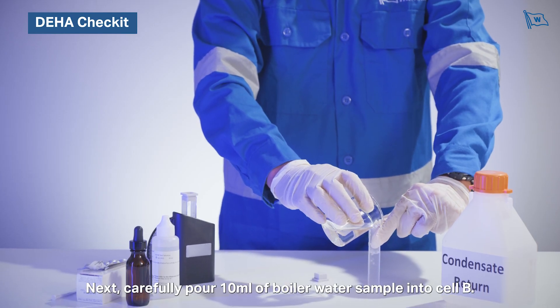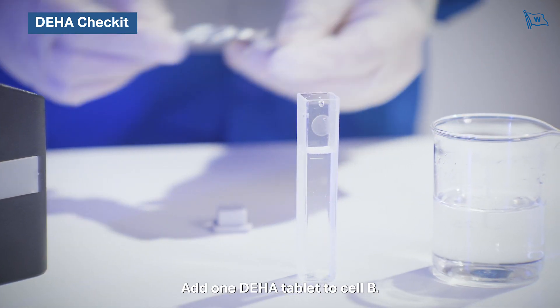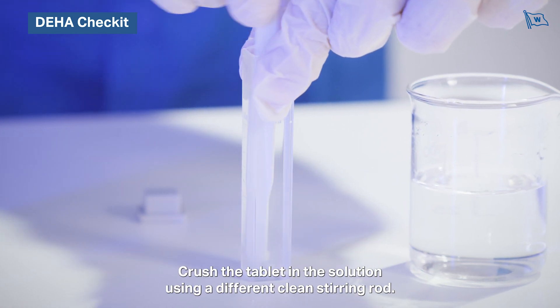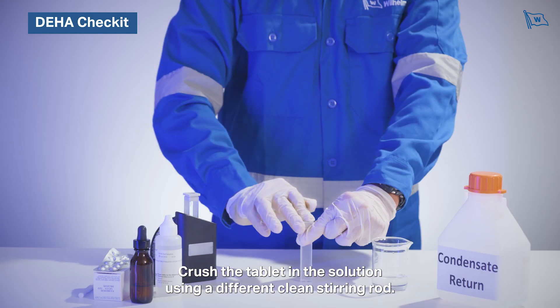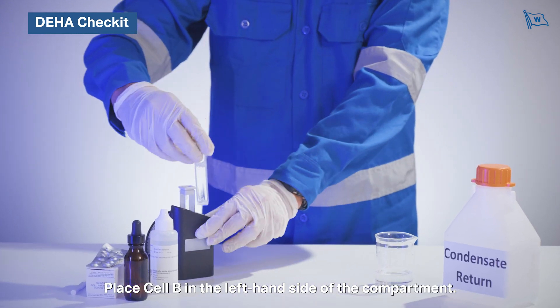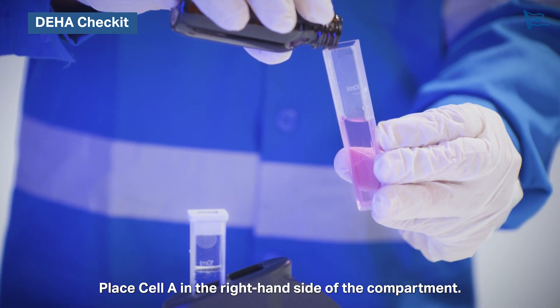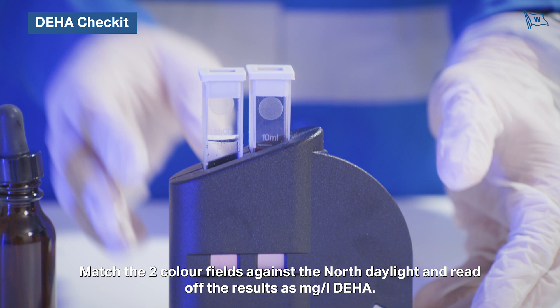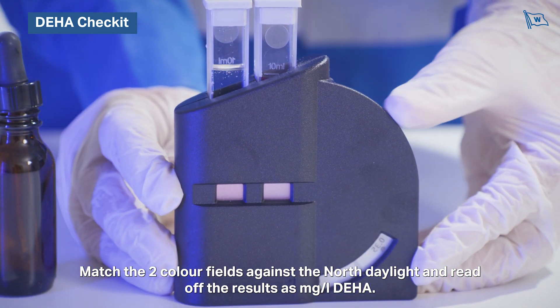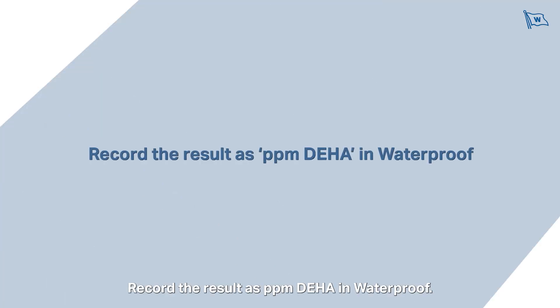Carefully pour 10 millilitres of boiler water sample into cell B. Add one DHA tablet to cell B. Crush the tablet in the solution using a different clean stirring rod. Place cell B in the left hand side of the compartment. Place cell A in the right hand side of the compartment. Match the two colour fields against the north daylight and read off the results as milligrams per litre DHA. Record the result as parts per million DHA in Waterproof.